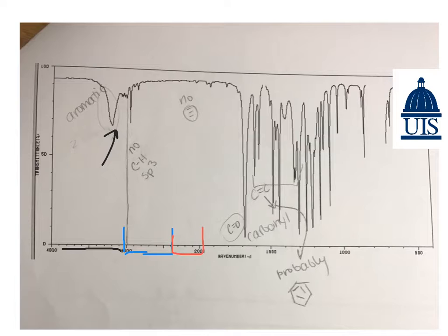In the next zone, we're looking for carbonyls, ketones, so like a C double bonded to an O. In our zone, you can see that we do have a C double bonded to an O present. And then finally in the last zone, we're looking for alkenes and benzenes, and you can see in here we have all these different spikes. So we most likely have a C double bond to a C or a benzene ring. And now once we have all that.